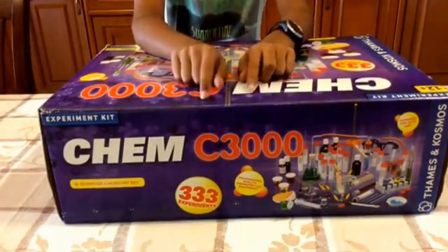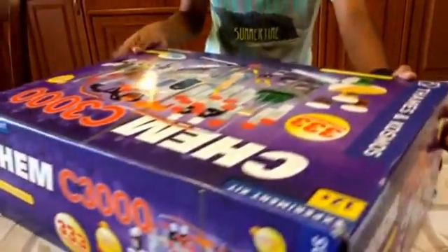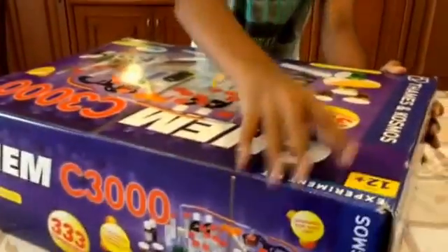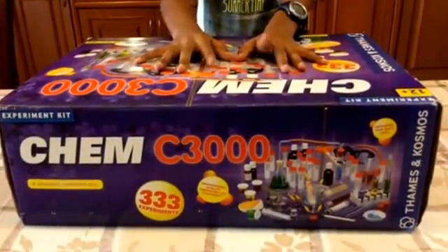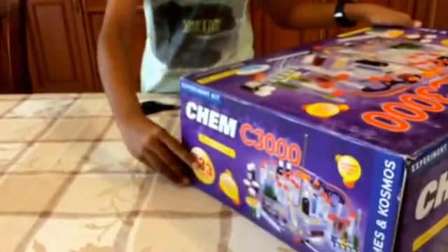This package has just arrived from Amazon.com. As you can see, the packaging isn't the greatest on all these corners, but I hope what's inside is going to be good. So without further ado, let's open it.